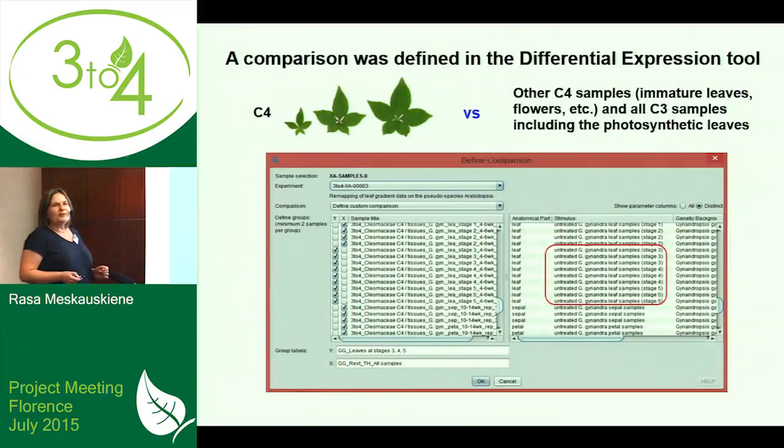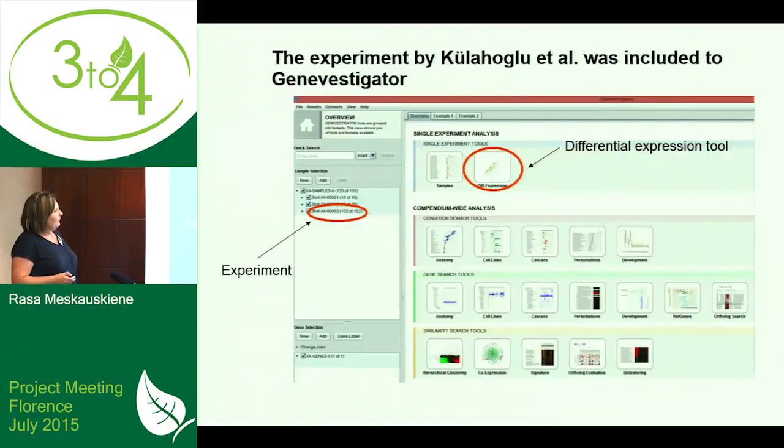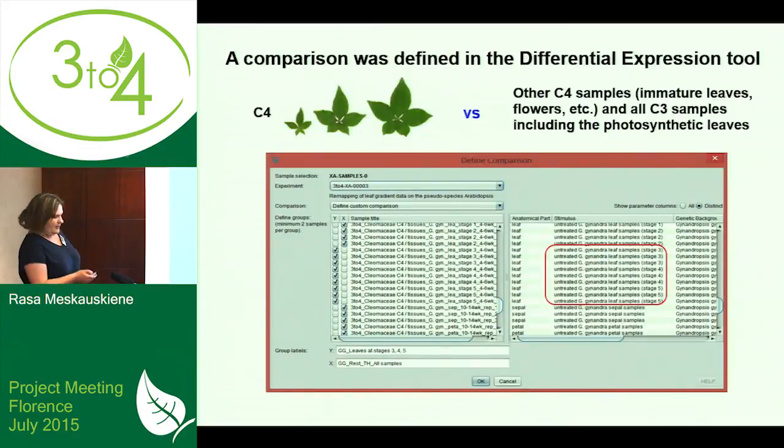So in that tool, if you open it, you can choose an experiment that you want to analyze. So I chose the one I just showed. And then you can define which samples you want to compare.